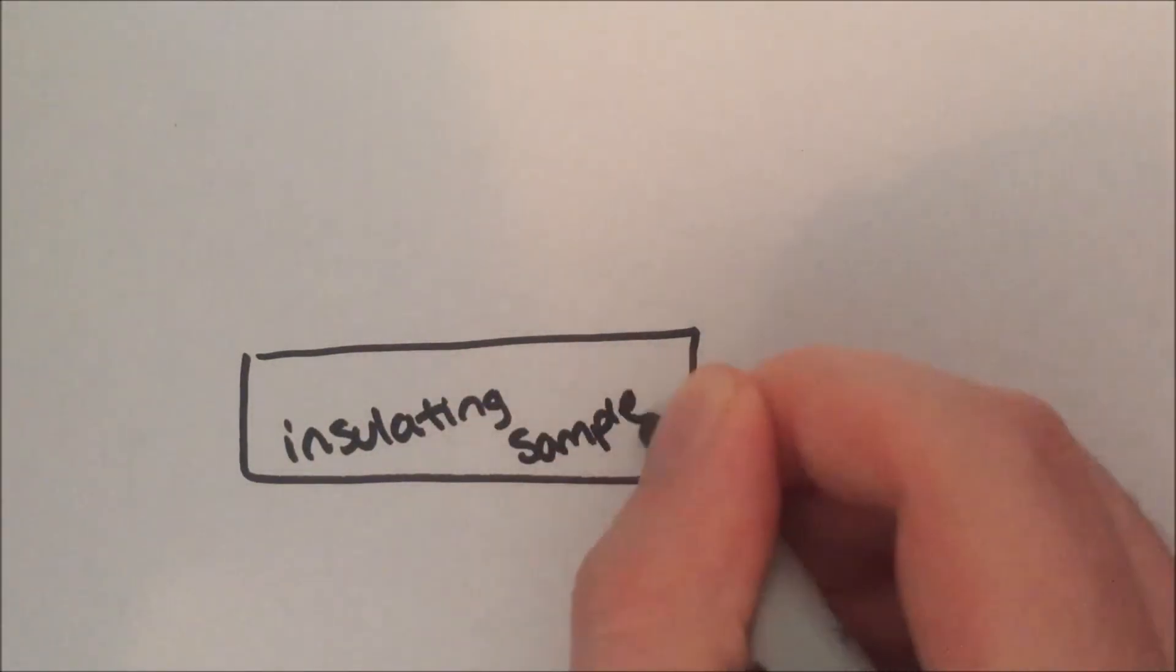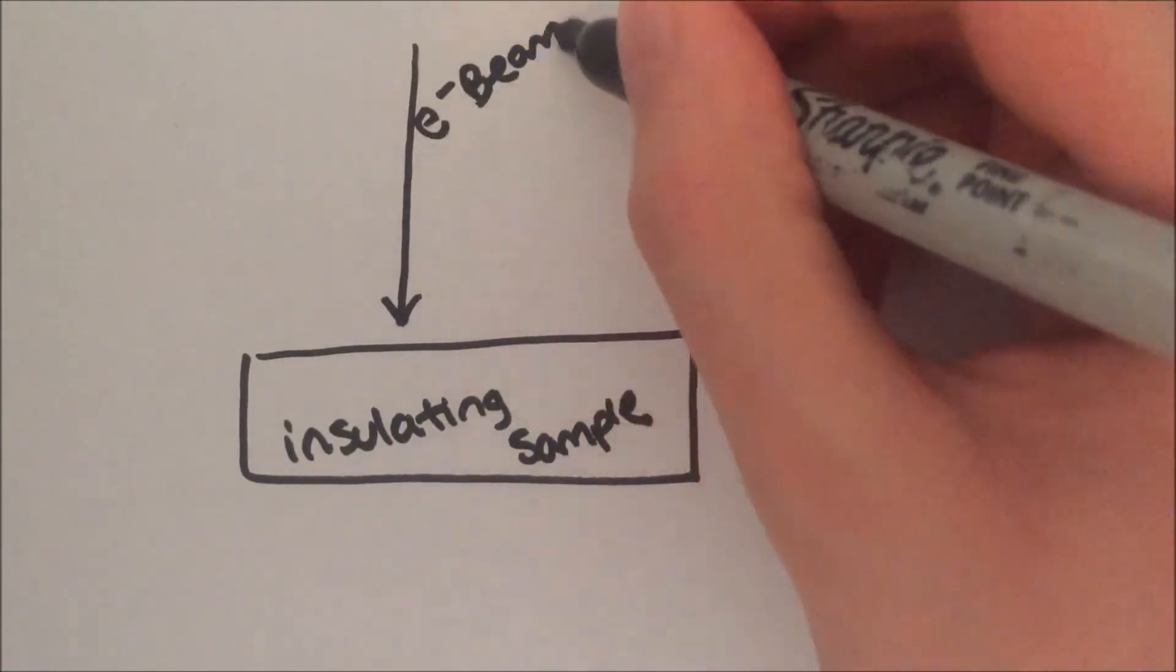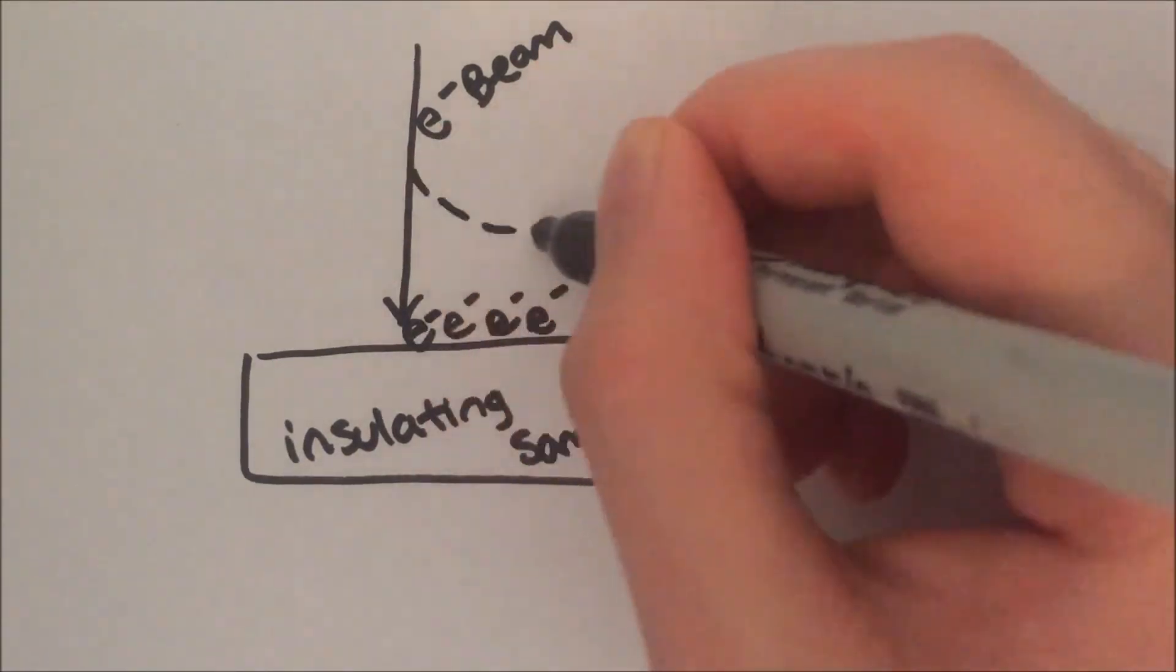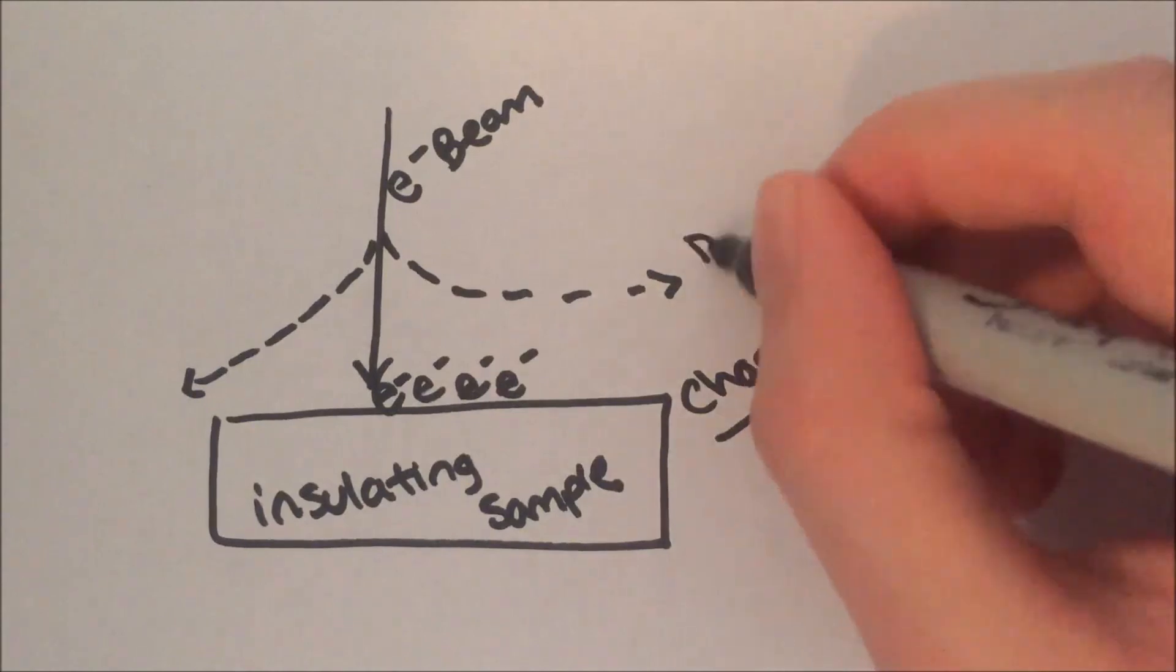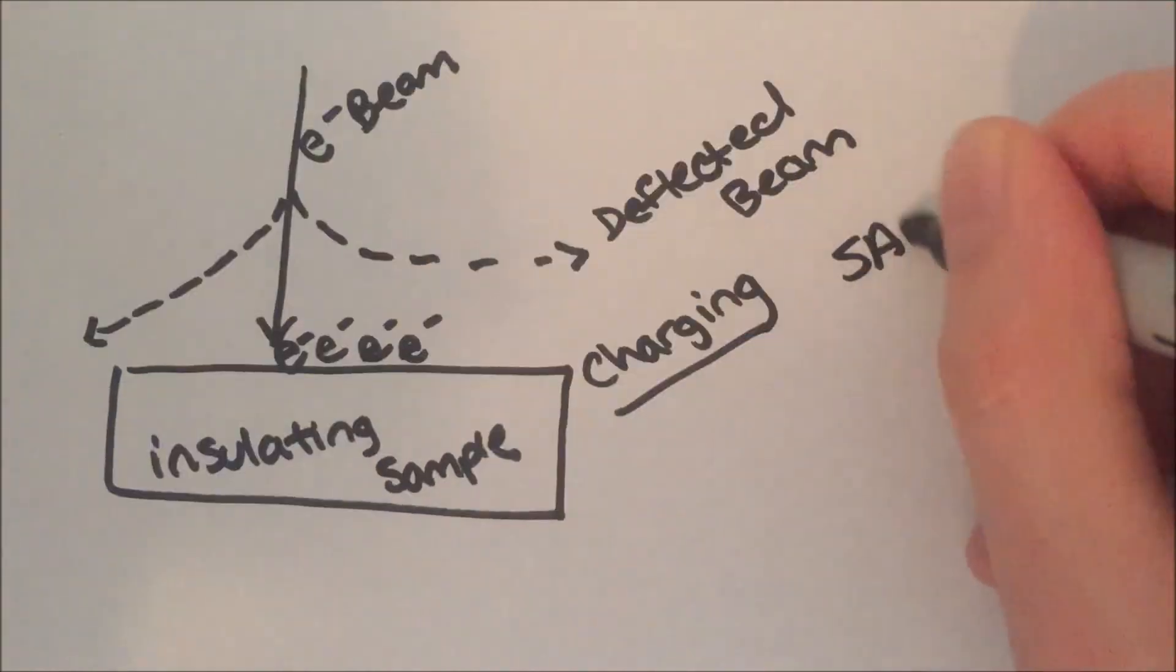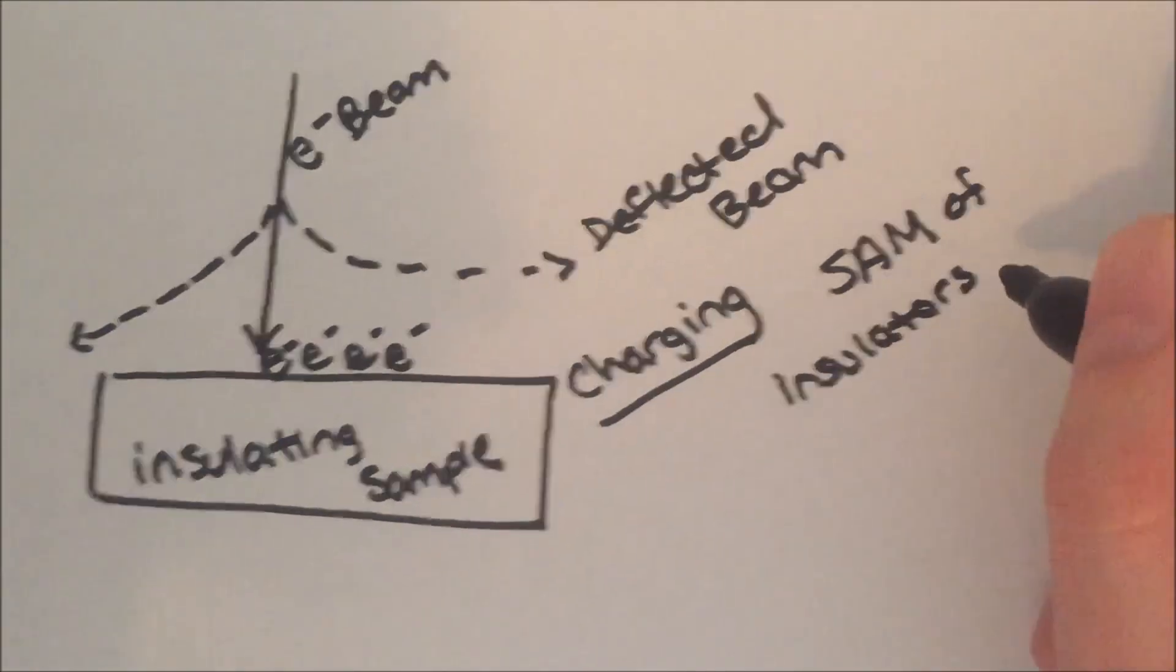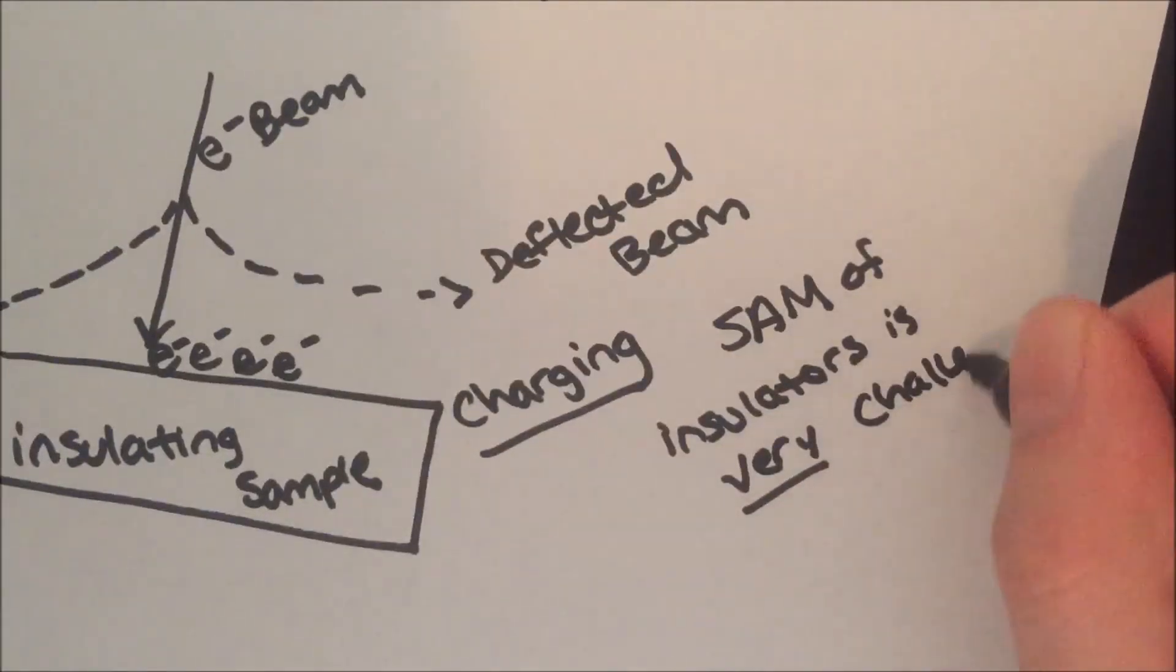Insulating samples also pose a challenge to analyze by Auger electron microscopy. Insulating samples prevent the flow of electrons away from the interaction area, creating a buildup of charge which can deflect the incoming electron beam away from the sample. This effect can make imaging and analyzing insulating samples very challenging.